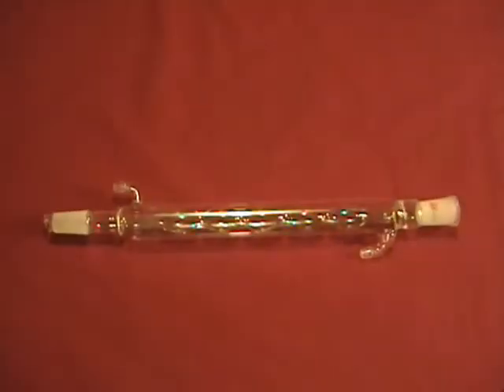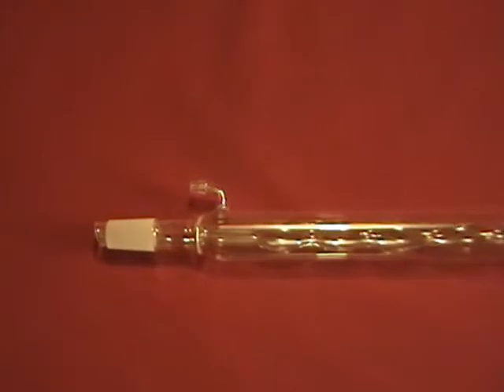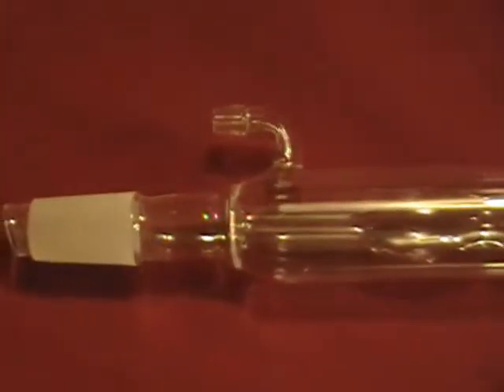This is a new Allen or reflux condenser with an effective jacket length of 300 millimeters. It has both male and female 24/40 ground glass joints.